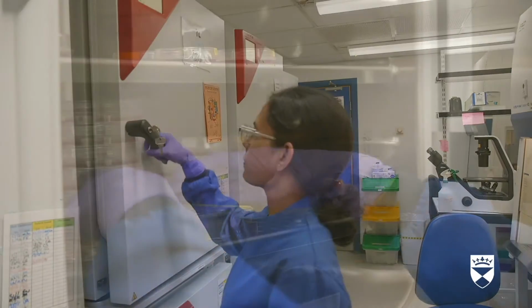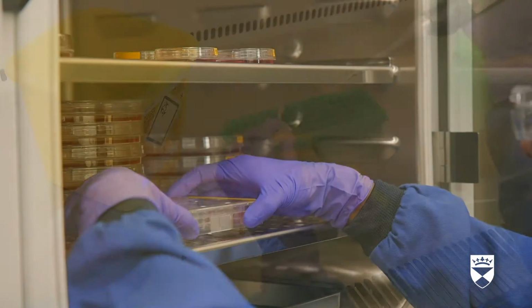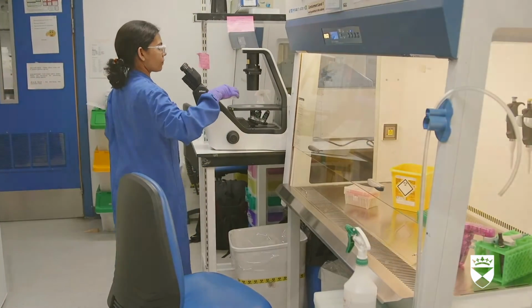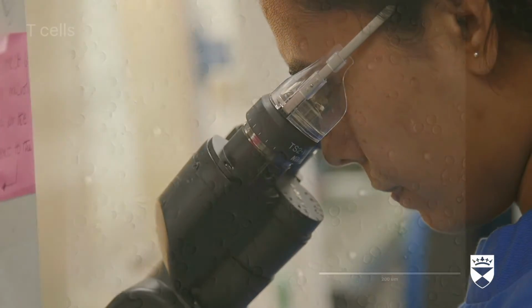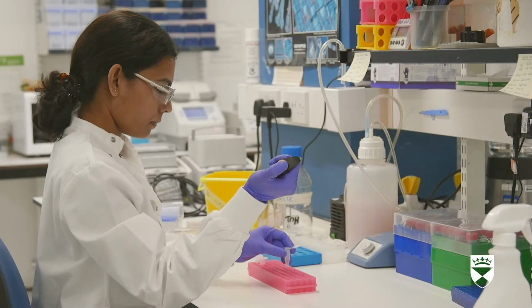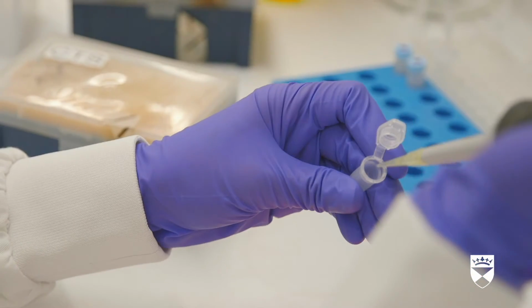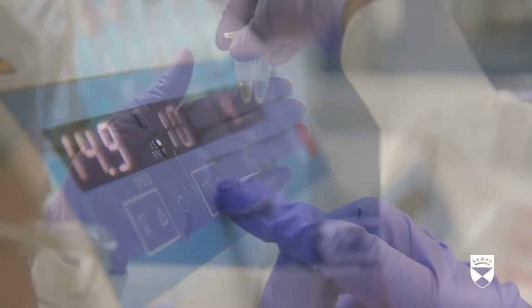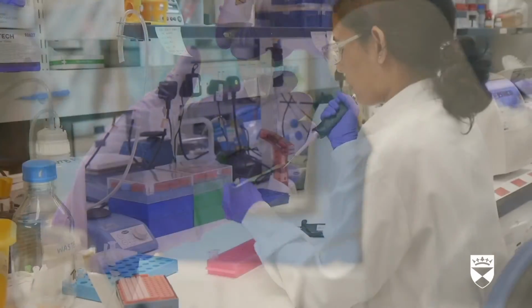The first step is to create an immune response. We do this by activating the immune cells with antibodies. We are specifically interested in items called proteins that are made by the T cell during the immune response. To get to them, we break open the T cells by adding detergent. We collect the protein and wash it several times.